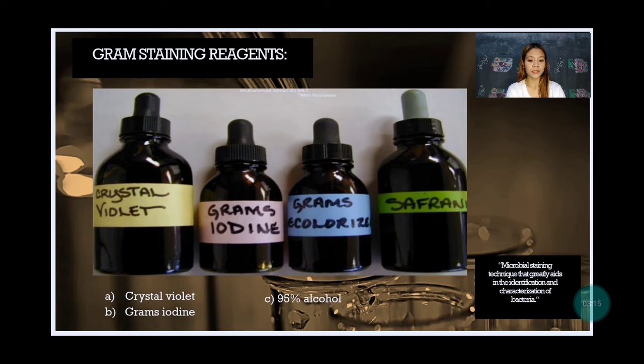The third one is 95% ethyl alcohol, a reagent used in qualitative procedures to differentiate Gram-negative and Gram-positive organisms. And lastly is safranin, a biological stain used as a counterstain in some staining protocols, coloring cell nuclei red. It can also be used for the detection of cartilage, mucin, and mast cell granules.